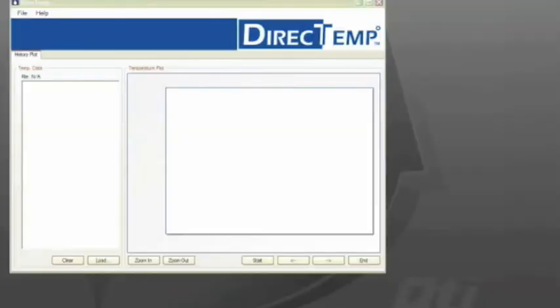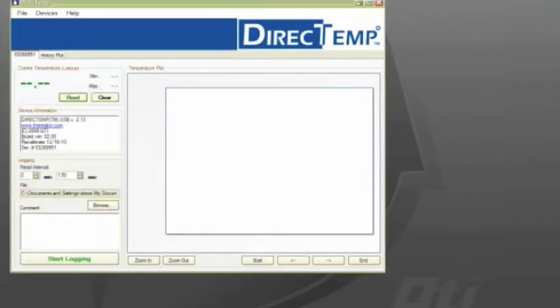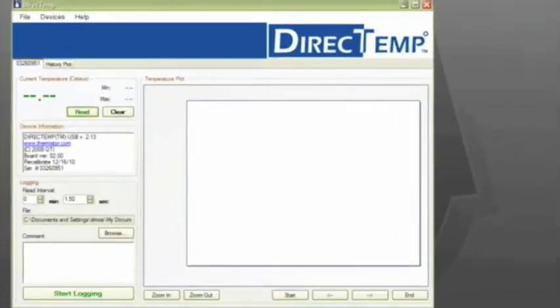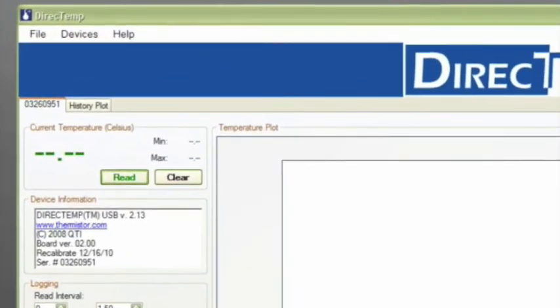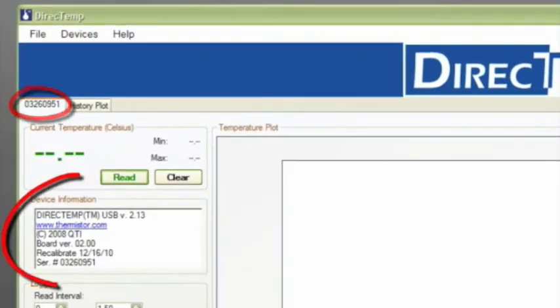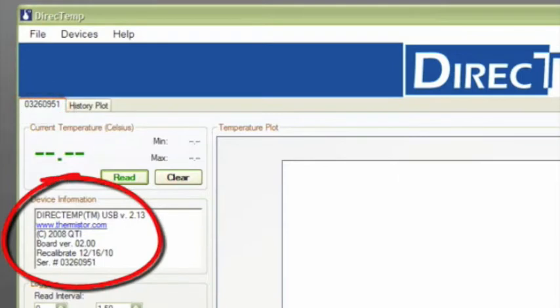You should have the direct temp software running before plugging in the probe. A new tab will appear next to the history plot tab on the left side of the screen. The serial number of your unit will appear in this tab as well as additional device information.